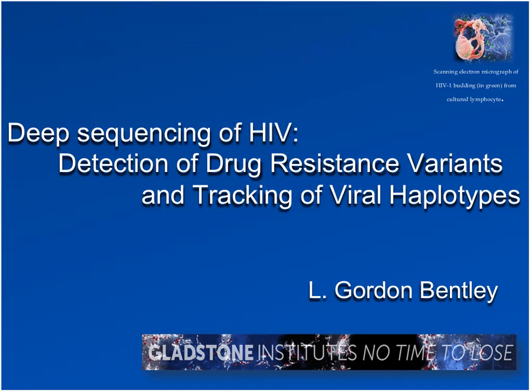One person asked, how much plasma was used as an input prior to PCR? Typically, we use 1 milliliter of plasma. We extract RNA from 1 milliliter of plasma. Viral load does have a bearing on that, and if we need to have more copies going into a particular assay, we may extract from more, but typically it's from a 1 mil aliquot.